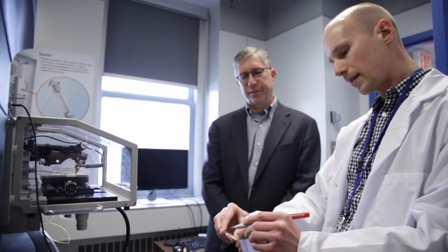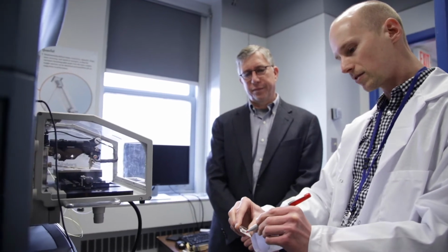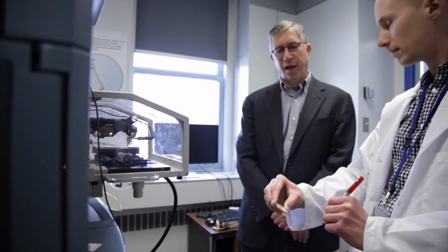DNA genomic testing. One of the exciting things about mass spec-based approaches is that we can measure all of the chemicals that are present in a given cell or group of cells, including cancer cells or benign cells, and understand in a kind of holistic way what the functional status of that cell is, what it's using for energy, etc.